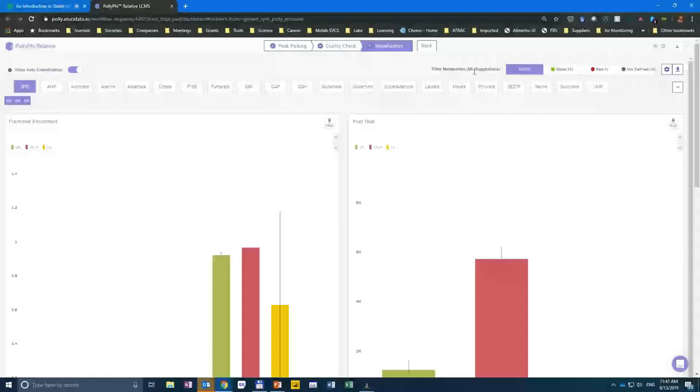So as you can see, going a little lower on your right side, that's literally what it says. You can filter those metabolites by sort of good or bad groups. I will not do it. I'll actually show you. I like to work with real data, and that's what I'm showing you here, is that there are situations where you see large error bars because maybe the metabolite was not detected in one of the groups.